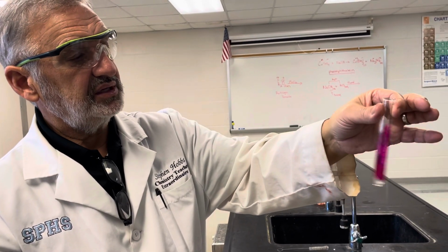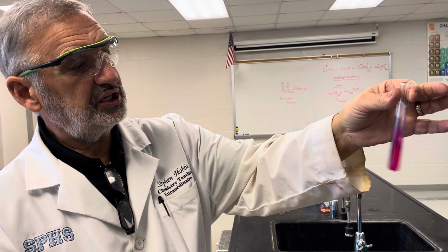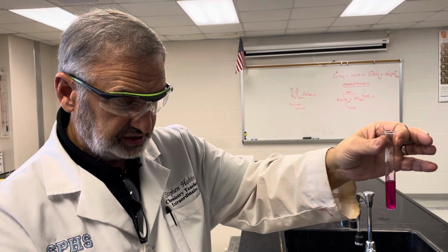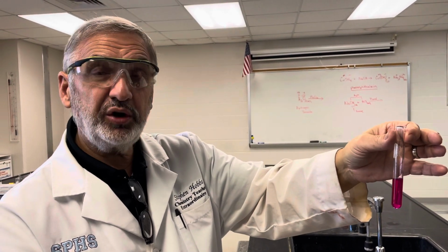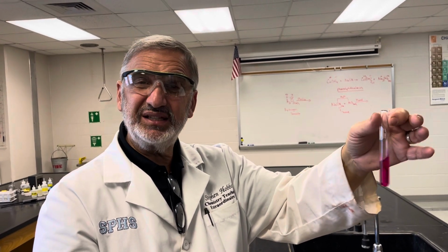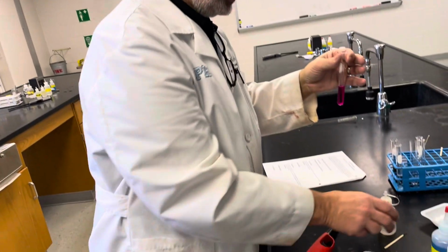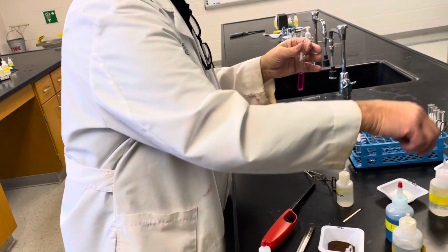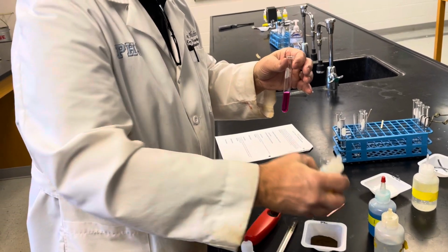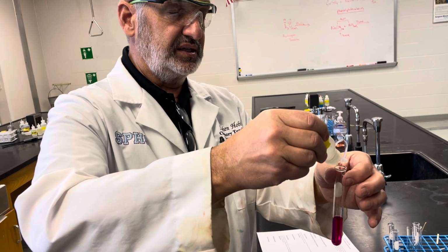Okay? So now, will it stay or will it go? So the color stays now, and as a result, we now have more OH minus than we do H pluses. So when there's more OH minuses, the phenolphthalein is this magenta color. Now we can go backwards and add some more HCl, and see if they can seek out the OH minuses.